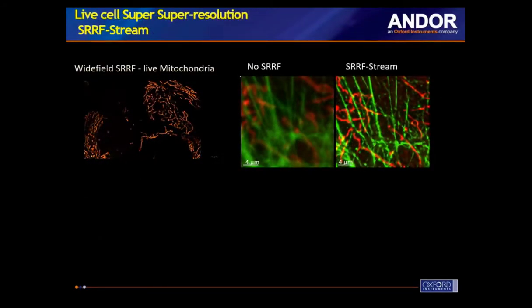But sometimes researchers need super resolution, and need super resolution in live cell. The problem is that techniques that deliver super resolution most of the times are not compatible with live cell imaging. And why? Due to very complex sample preparation, due to very long times required to deliver an image, and very importantly, due to the high energy requirements to deliver a super resolved image.